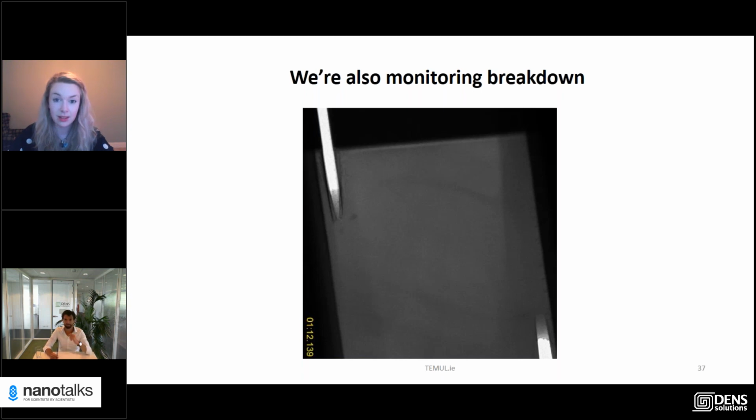Basically I have a number of questions, but maybe we should also talk afterwards. So right now, what you're doing is in-situ biasing, and you're driving domains, and the domains are related to the strain in the material. I'm curious if you're following a path, because whenever you prepare a sample, you introduce stresses. So do you anneal the sample beforehand and then do biasing? Because usually the heating helps release the stresses to go to a ground state.